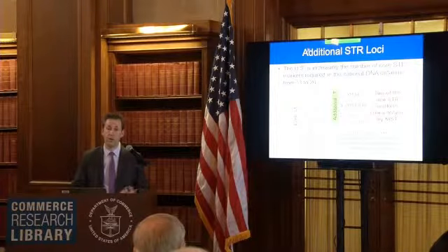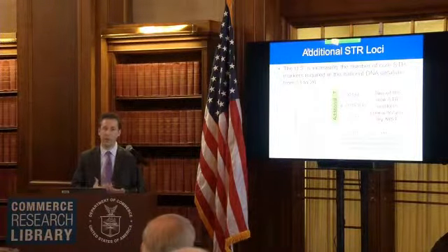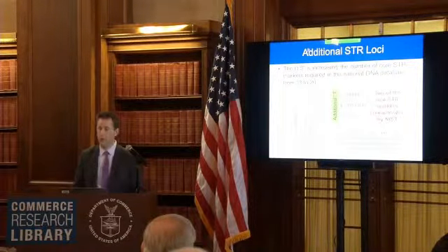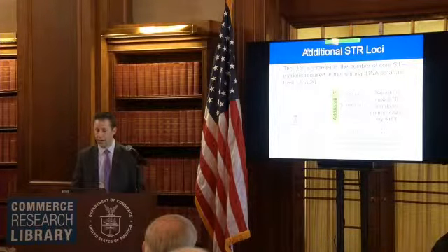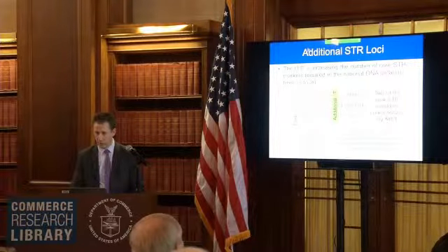from the mini STR. NIST characterized these markers on population samples, published that information, and then those were brought into the additional loci that the U.S. is going to be using. So this is just showing our support and impact of characterizing genetic markers for the U.S. database.